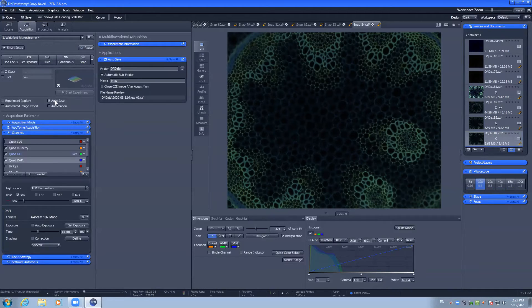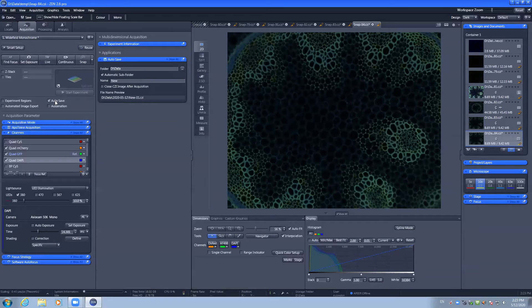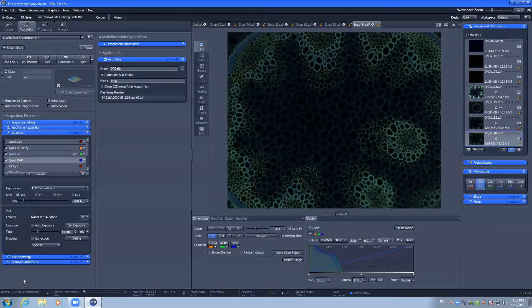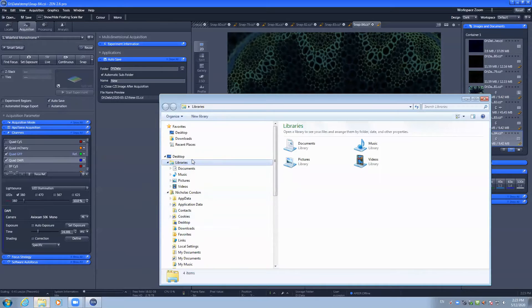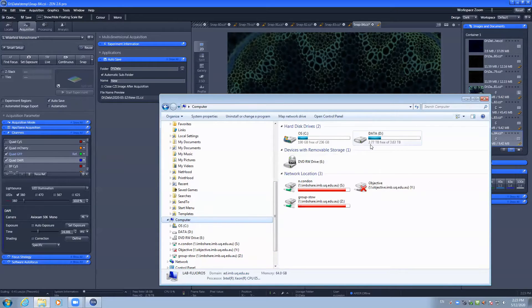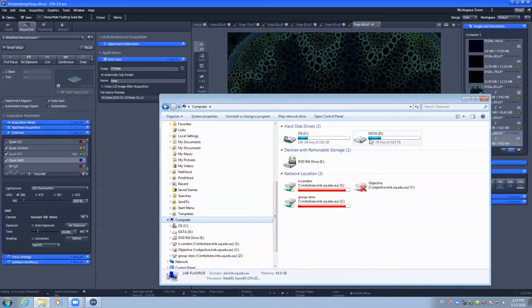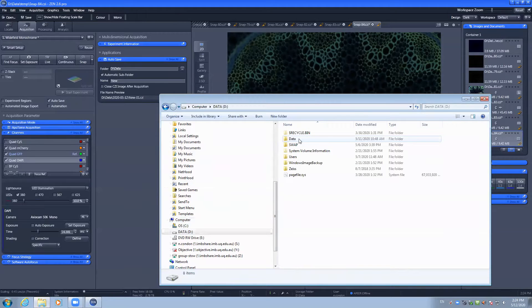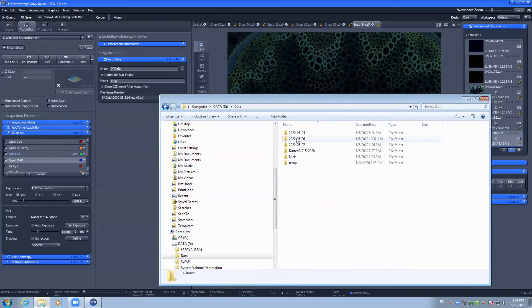Autosave will automatically save your experiment and your captures into the correct folder. For this microscope, the computer has two hard drives. Data should be stored on the data drive during your session.